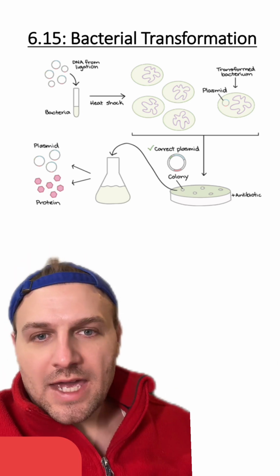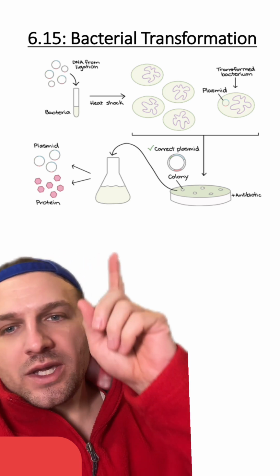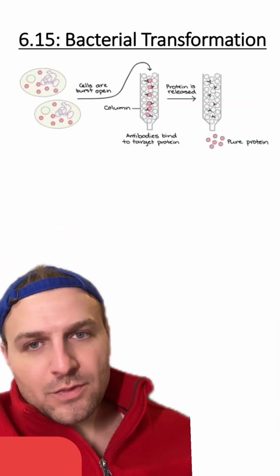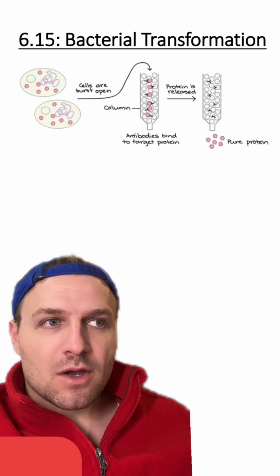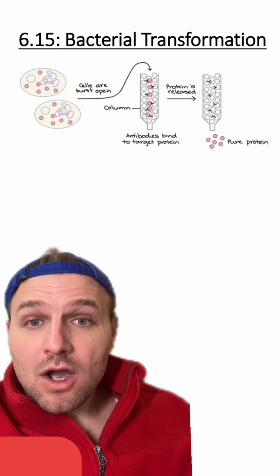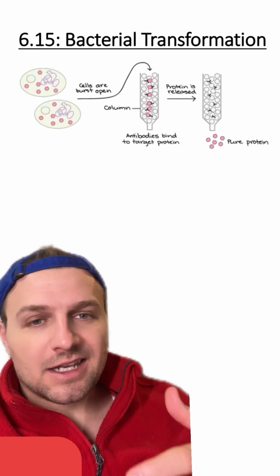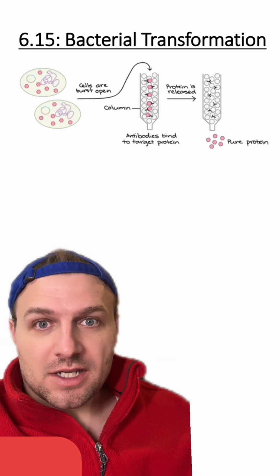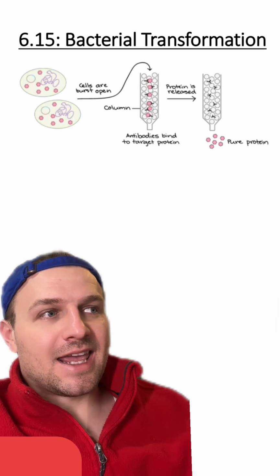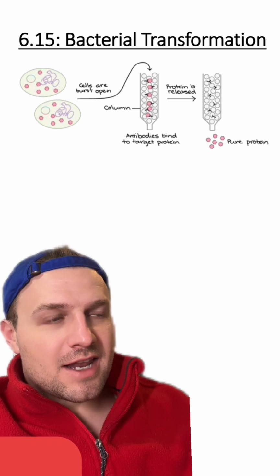Once we have bacterial cells with the plasmid with this gene that we want, we can take them and grow them even further, making the protein that we want. Once we have a culture of this bacterial cell with the added plasmid, again, we have transformed the bacteria, we can use that protein by extracting it and purifying it and just making it a pure protein. This has given us an ability to make protein at a much easier, higher, more efficient level than ever before.